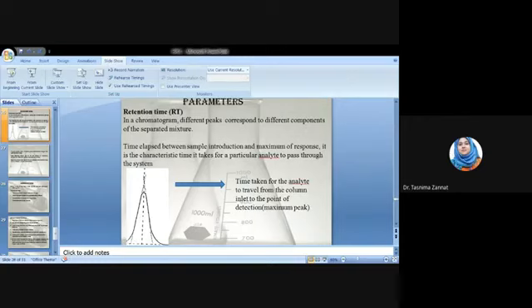Okay, now we want to enjoy a video on this HPLC.